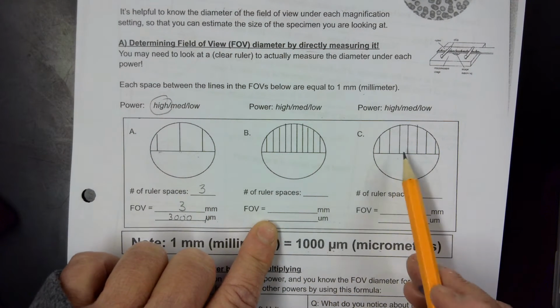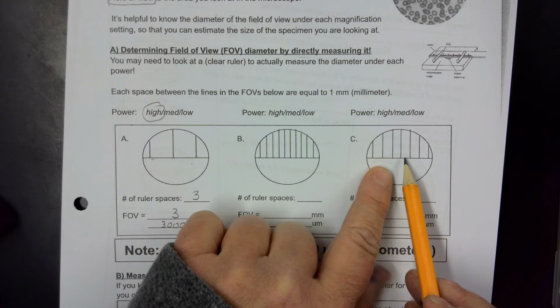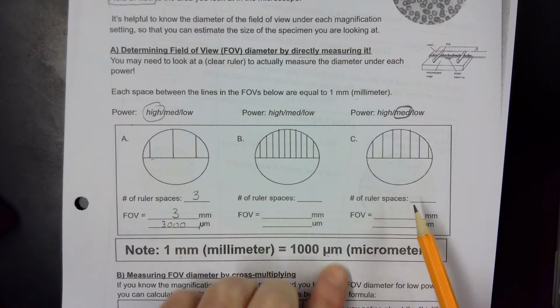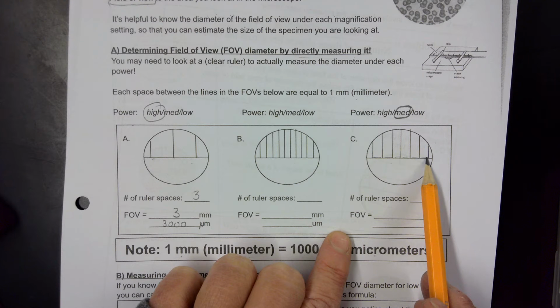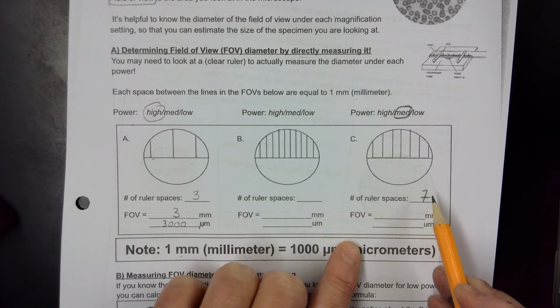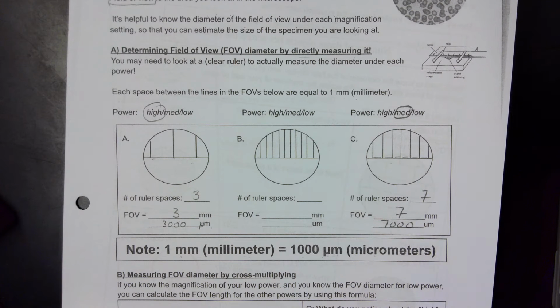If we look at this image right here, of the 3 images this is the one that's medium magnification, so we'll say that this is medium power. If we count up the spaces, I see 1, 2, 3, 4, 5, 6 full ruler spaces, plus one more, that's about 7 ruler spaces. So this is about 7 millimeters wide, and if we multiply that by 1,000, we get 7,000 micrometers.